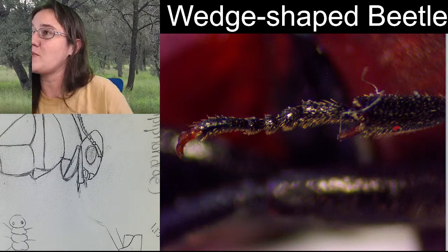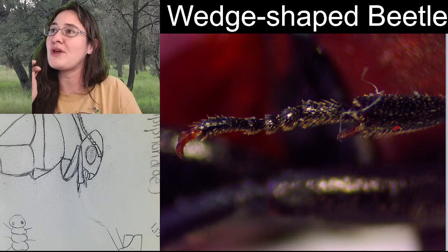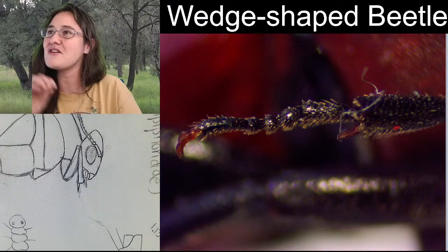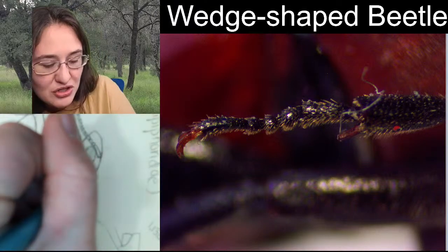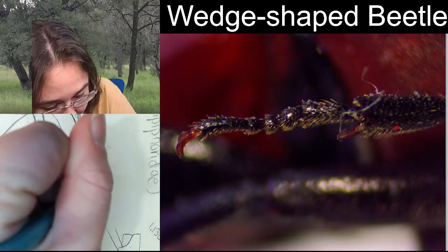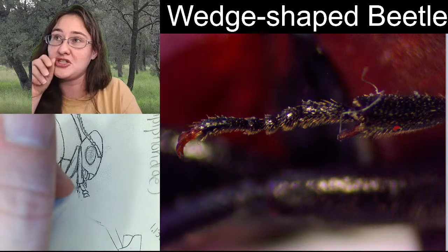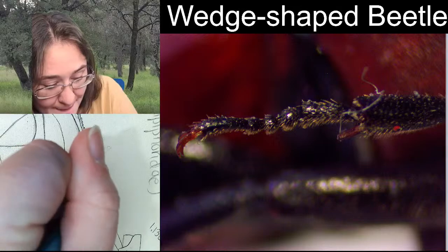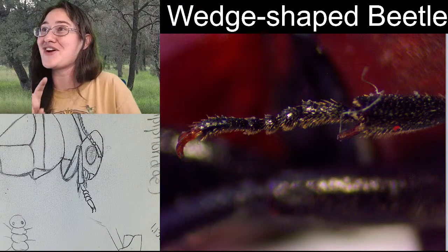Now, to me, it looks like we have 5 tarsal segments. We have the first one that's kind of that long rectangle. We have 3 what I would call cup tarsal segments, that are rounded like this, and they kind of sit in one another. And then the last one is elongated with 2 claws at the end. And if we were to change the focus and super zoom on the end of the tarsal claws, I believe that each one of the claws is split into 2. I was noticing that when I was moving it around and thought it was really cool. So I might be able to show you that. I'm definitely gonna try.